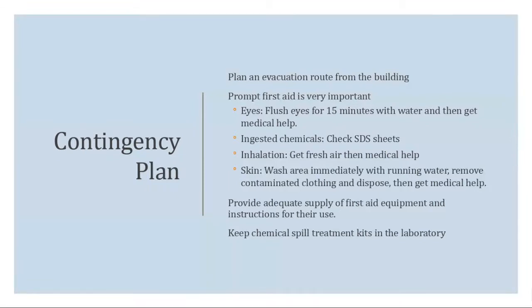Prompt first aid is important. If you do get something in your eyes, we have the eye wash station, and after 15 minutes of water, then you can get your medical help. Ingested chemicals, I'm hoping you're not putting your fingers in your mouth while you're in the lab, but because each chemical is different, you'll need to check the SDS sheets. Inhalation, same thing. Get out, get some fresh air. Don't stay in the area if you start feeling dizzy.